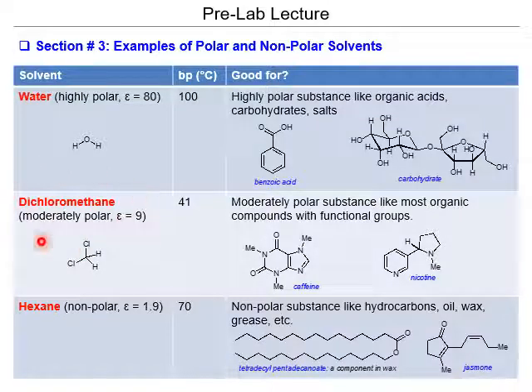especially if you will have to improvise or if you are trying to come up with a new process. So dichloromethane is very popular in the labs. You could say it's probably my favorite solvent, or maybe second to acetone. But it's very important because it's moderately polar, and it will dissolve a lot of the compounds that I am working with in the lab.